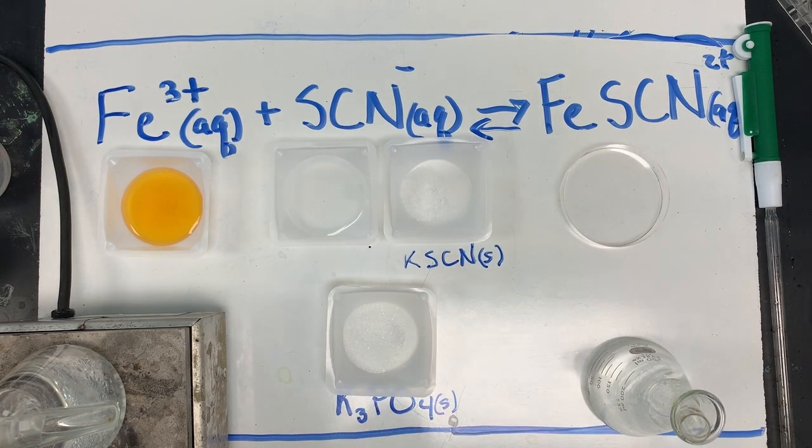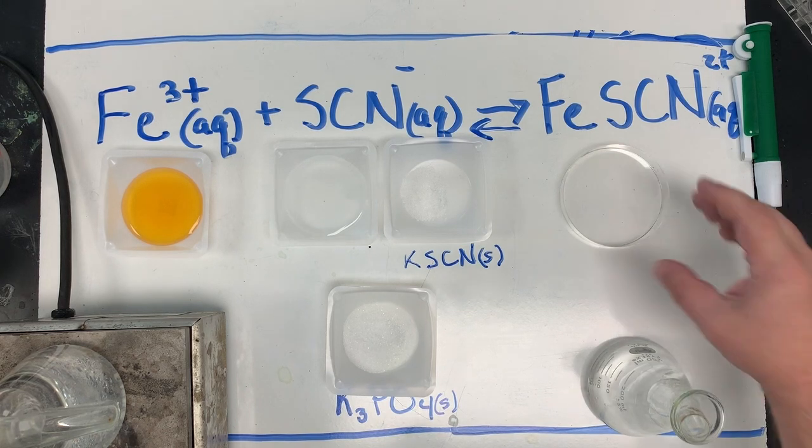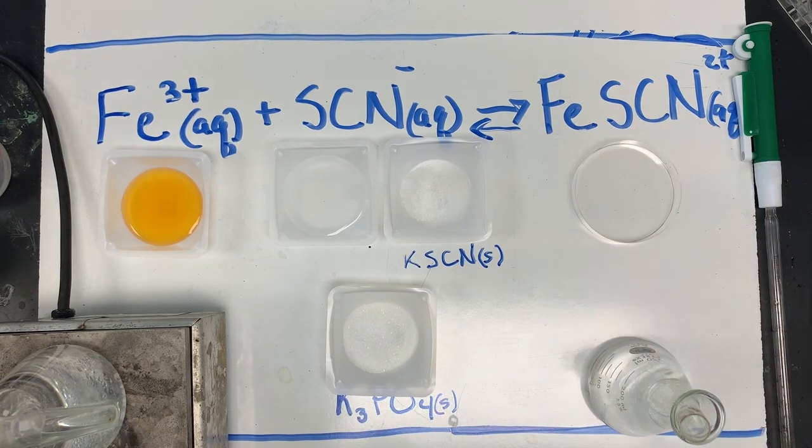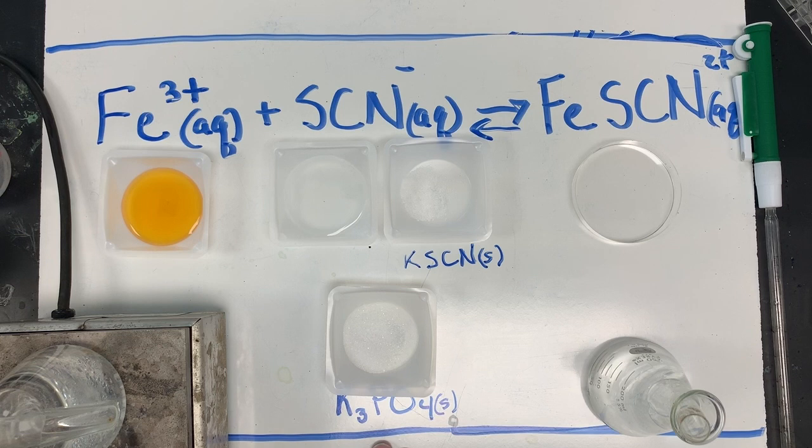And then next to it, I have some crystals of potassium thiocyanate that we're going to play with. Over here, I have a dish. We're going to mix these two together and create our product, create our equilibrium. And then down here, I have a third chemical called potassium phosphate, and we're going to use that to drive our equilibrium as well.